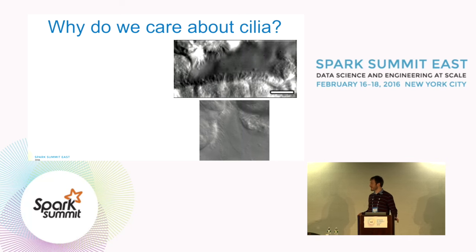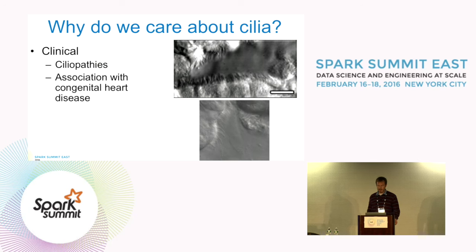And I'm getting kind of ahead of myself here. So why we care about cilia. I have two videos here. The top is what normal motion looks like. So everything looks like it moves fairly uniformly. You see kind of a wave moving along the cell wall. And on the bottom, I swear there's actually motion happening there. It's an extreme example, granted, but very little motion. This is a classical ciliopathy. There's very little ciliary motion. Nothing is moving around. Everything's getting clogged up.